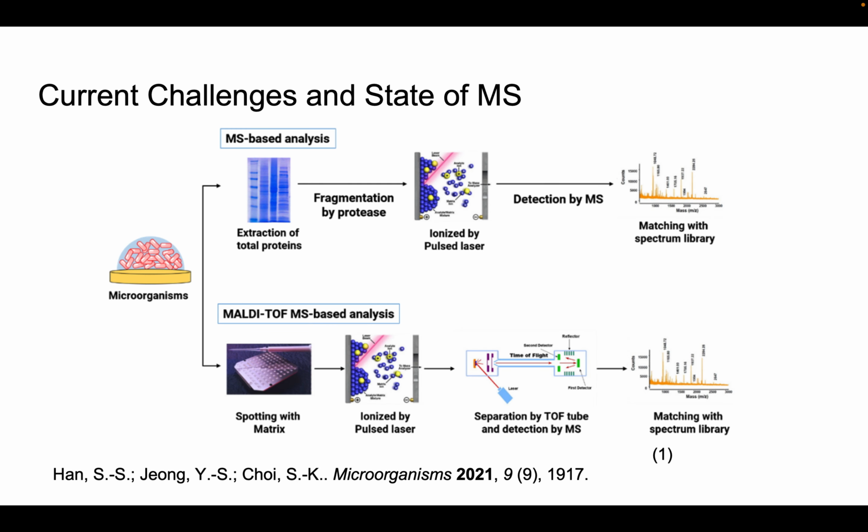So MALDI is being applied in several fields. Here in this slide, the standard clinical procedure was to isolate protein extracts from sample bacteria and then run the protein extracts on the SDS-PAGE gel to then be able to separate them, using mass spec and also ionizing through a pulsed laser. So this process of making the SDS-PAGE extract can be very tedious.